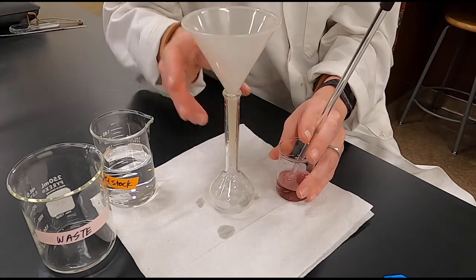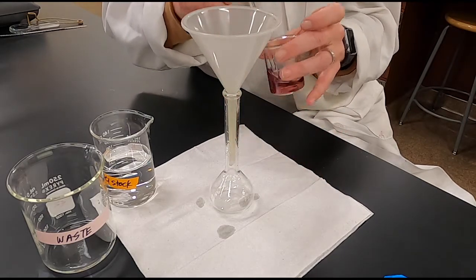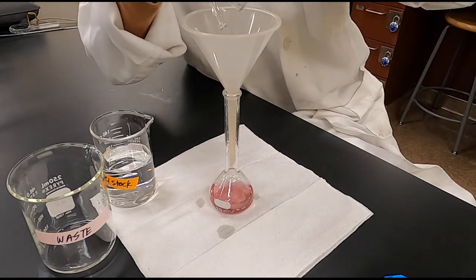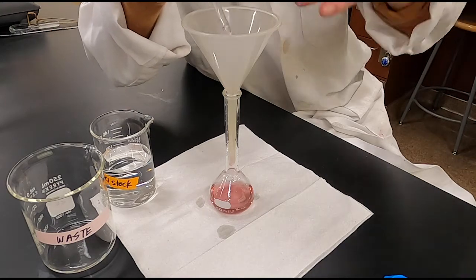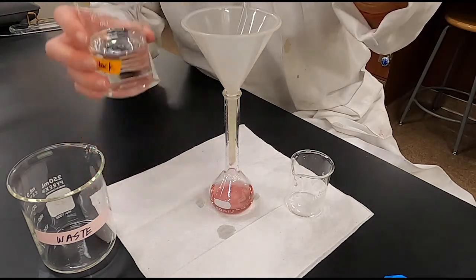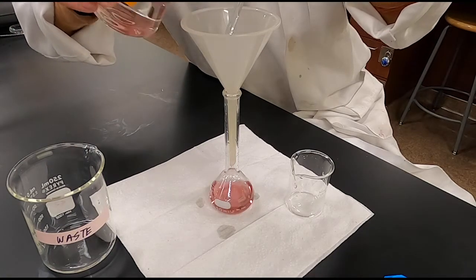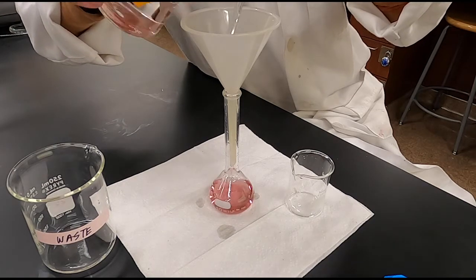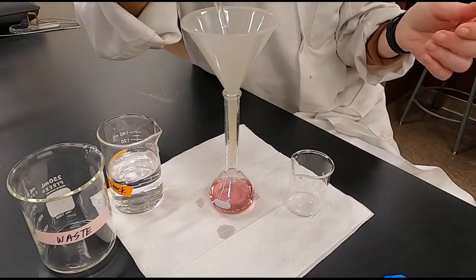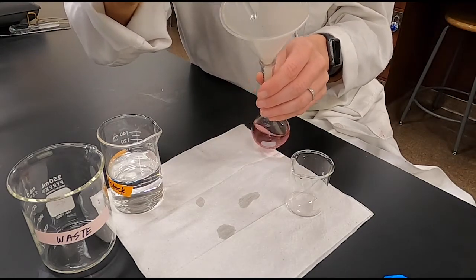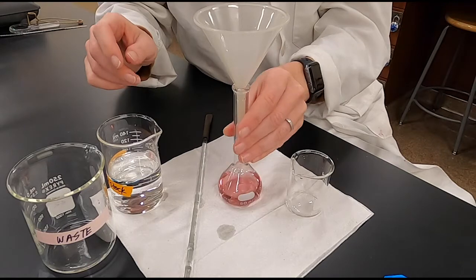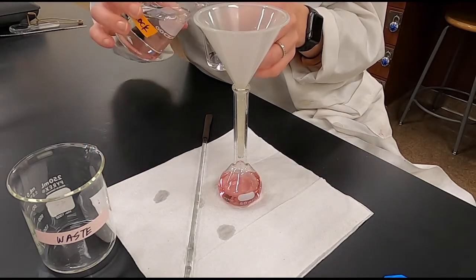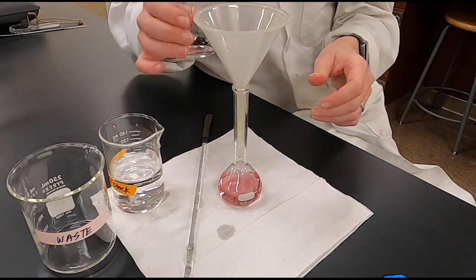When you do a quantitative transfer, you want to use a funnel so that you don't spill any. Then you want to make sure that you rinse off any glassware that came into contact with your solution. I'm going to rinse off this stir rod, and then I'll also rinse out the beaker another time and the funnel. This ensures that all of the solid that we weighed out actually makes it into the flask.